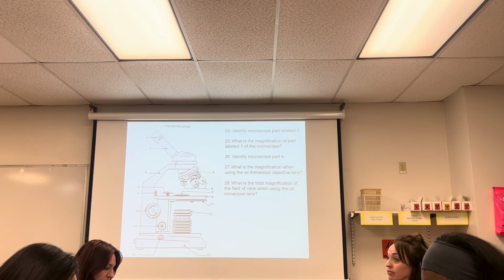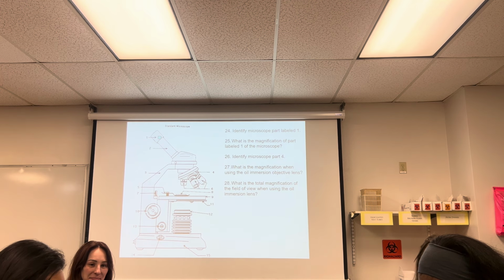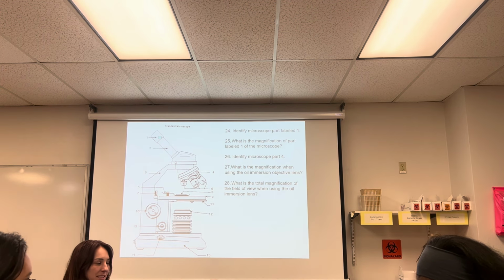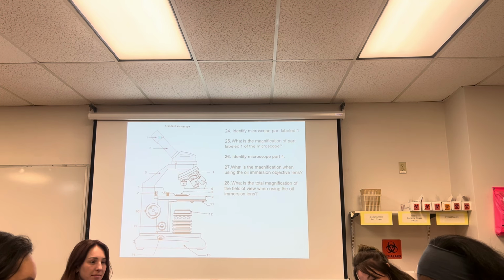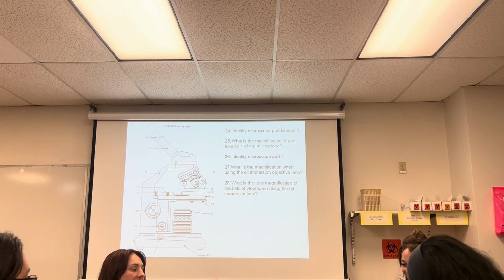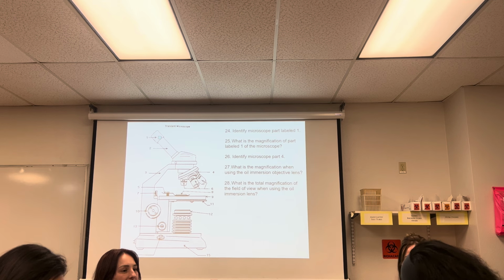So if you were asked what's number 10, you would say the coarse adjustment. Like course, C-O-U-R-S-E? C-O-A-R-S-E. Oh, okay. But Christy, if you said C-O-U-R-S-E, I would accept it. But that means like a course like we're taking a course, or a golf course.